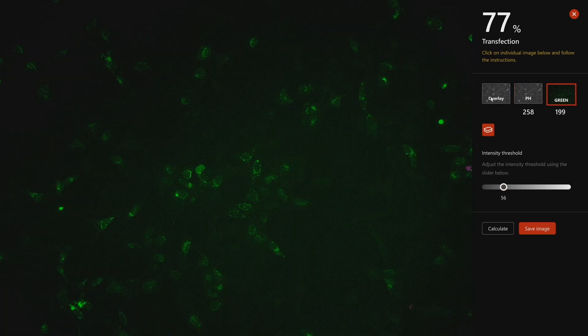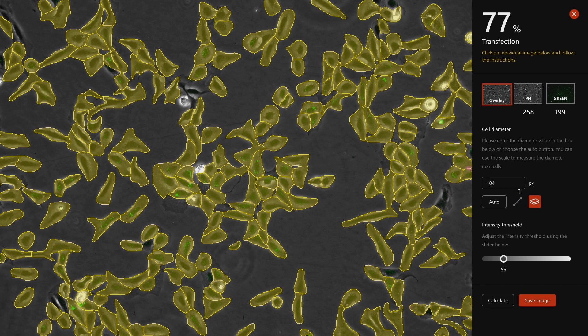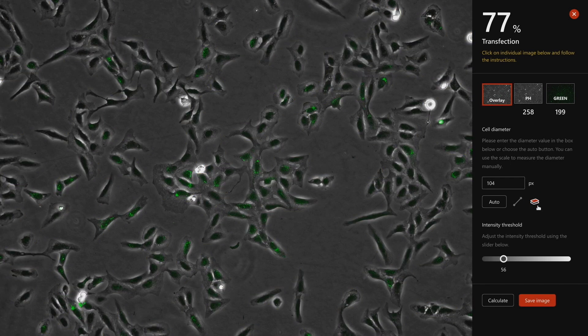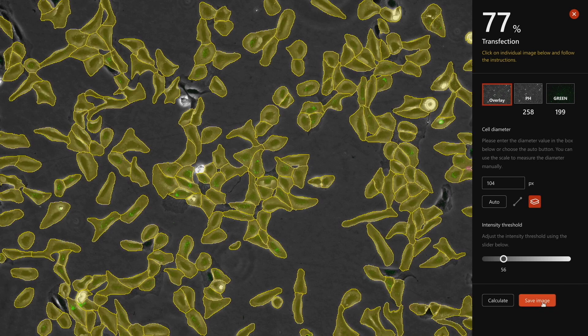Mateo FL will automatically calculate the transfection efficiency. Once you're happy with your results, click on save to save them in the gallery.